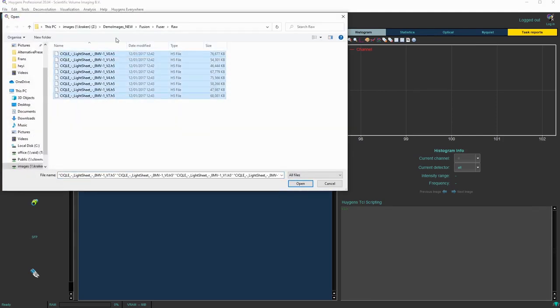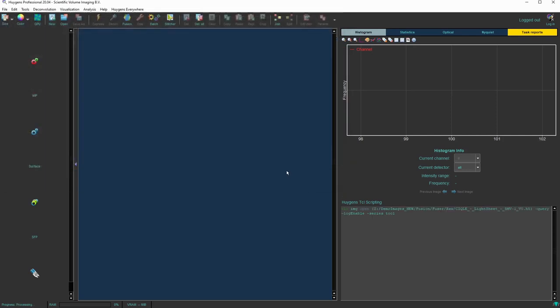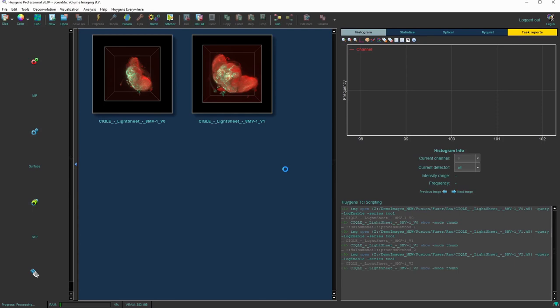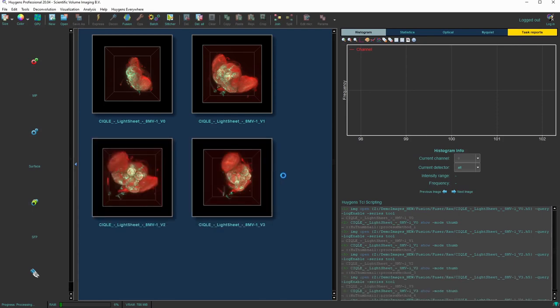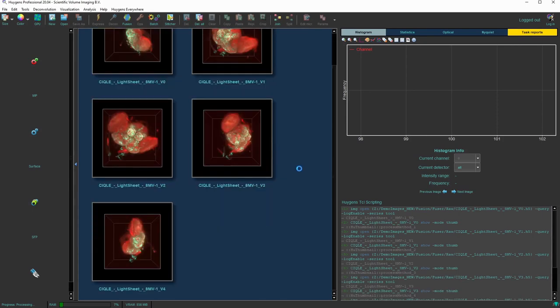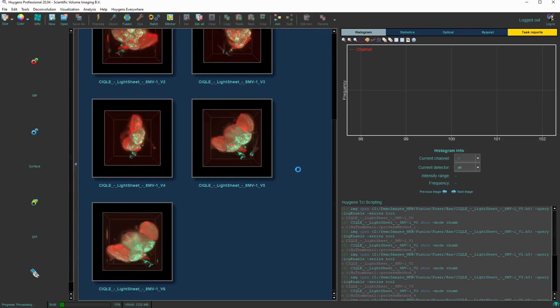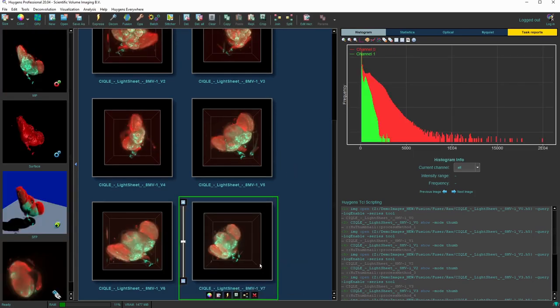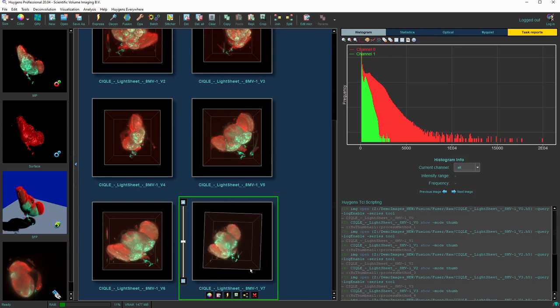Let us select the input dataset - eight views that are 45 degrees rotated with respect to each other. We see the thumbnails appear in 3D as the images are loaded, and we can see that the rotation is along the axis that is in the vertical direction in these previews.